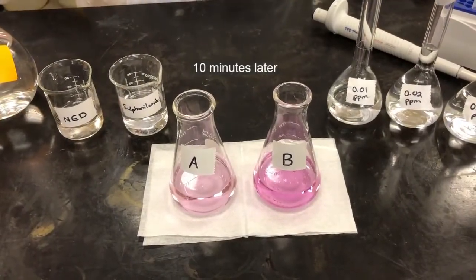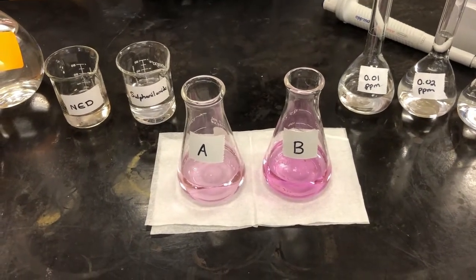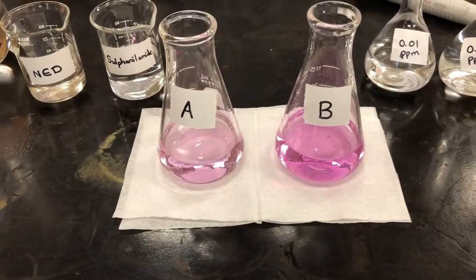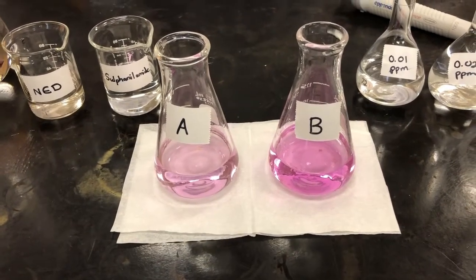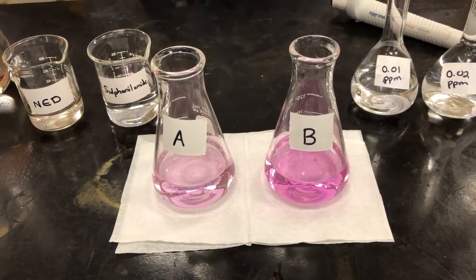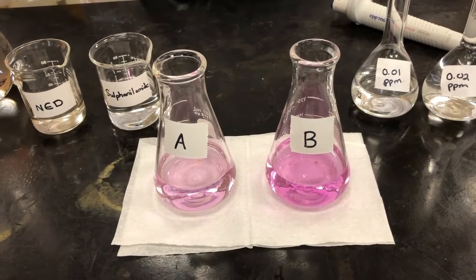Okay, so now we can see that we have a lot of color developed already in our samples, A and B. You can tell just by looking at them that there obviously is a difference in the nitrite concentration. One is significantly darker in color than the other. And you should see that reflected when we measure them on the spectrophotometer. So that's the next step. We're going to take our standards and our samples over to the spectrophotometer to get our absorbance measurements.